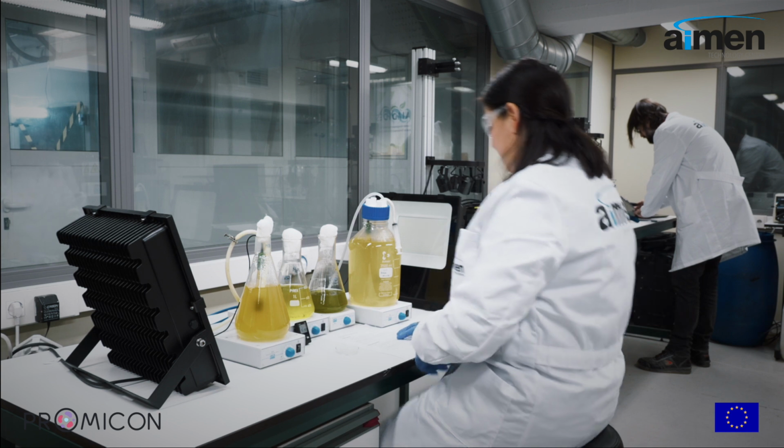In PROMICON's project, AIMEN is involved in the development of a spectral sensor which is able to characterize microbiome cultures in the UPC. To do that, we have to perform test campaigns of the microbiome in a photobioreactor.